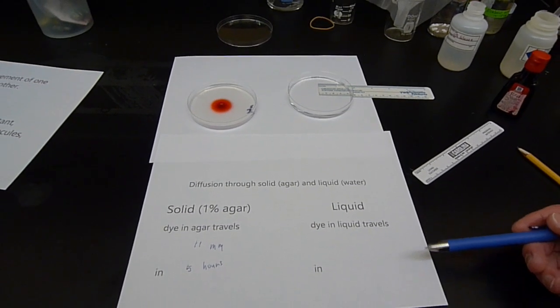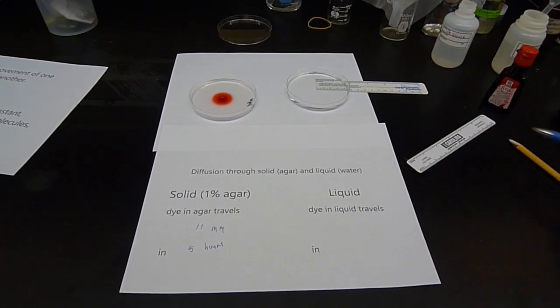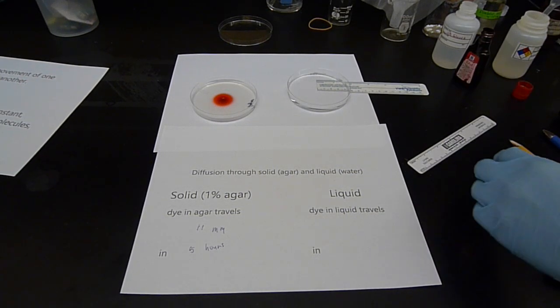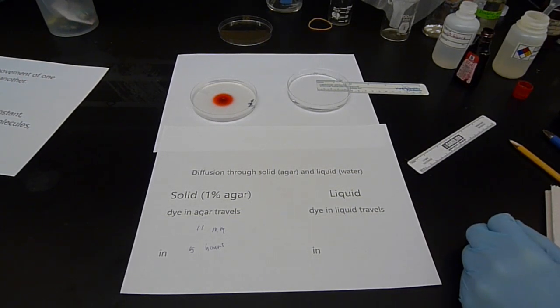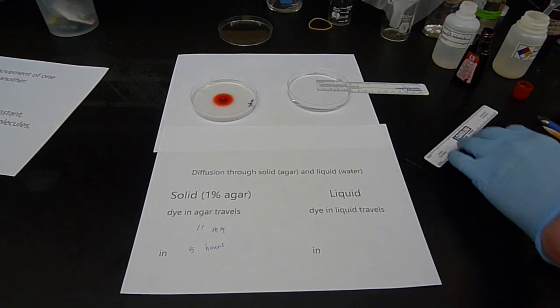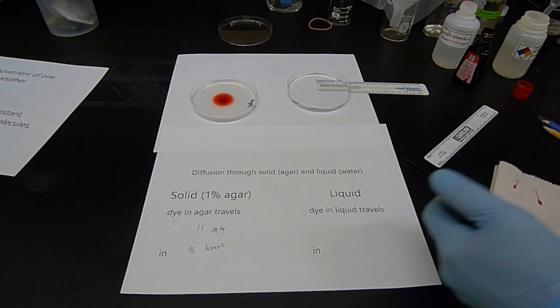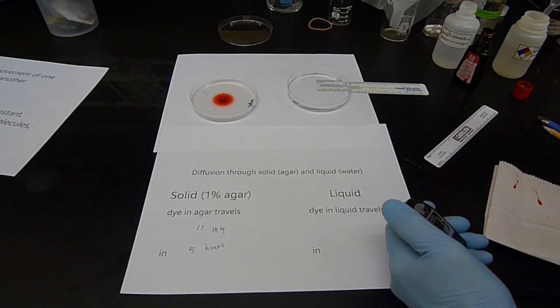All right. Now, in this other Petri dish, I just have some distilled water. And I'm going to put a drop of the dye in the distilled water and time to see how long it takes to diffuse, or measure how far it diffuses in, let's go for like 3 minutes. I'm going to be aiming for that origin of the ruler right at 0, but this will actually diffuse, or it will scatter over the surface pretty quickly.